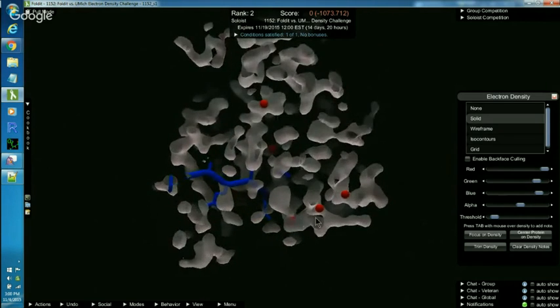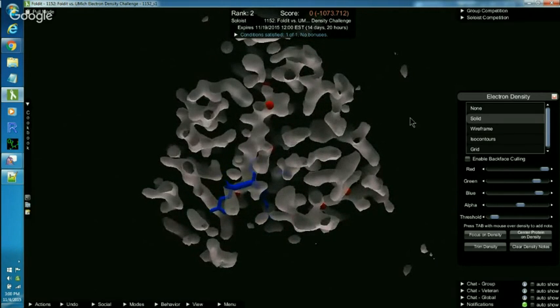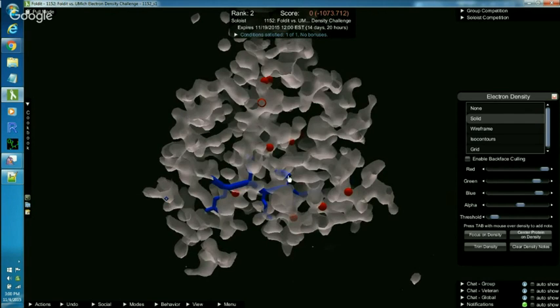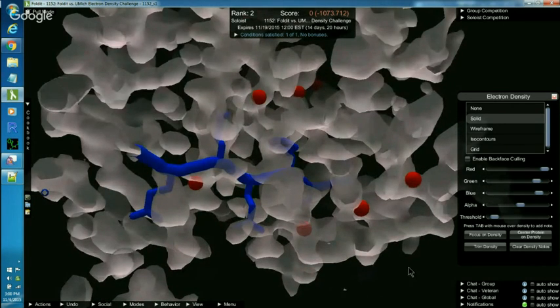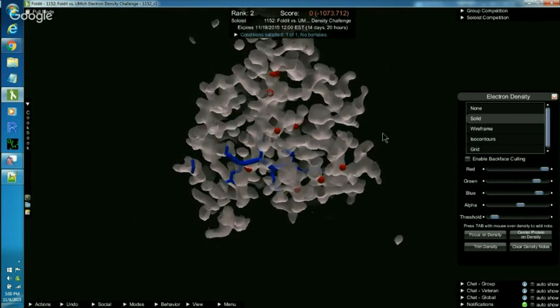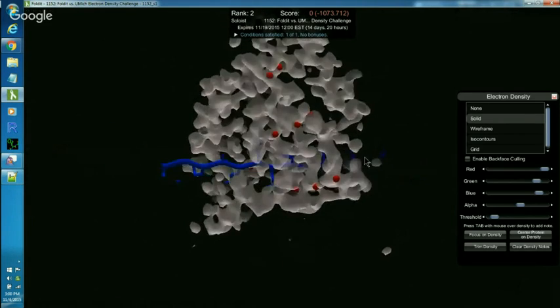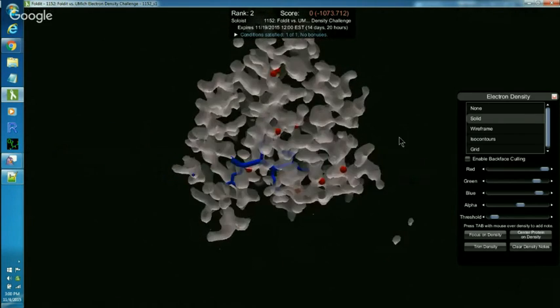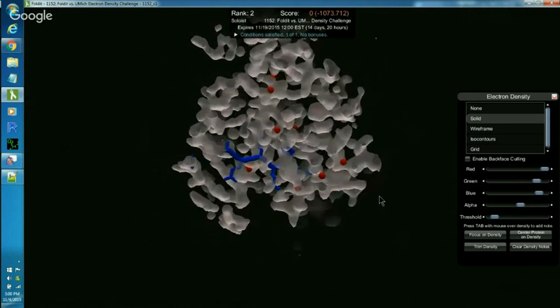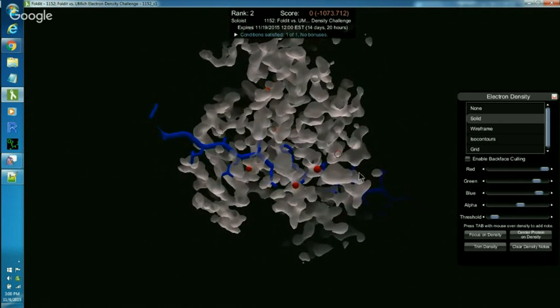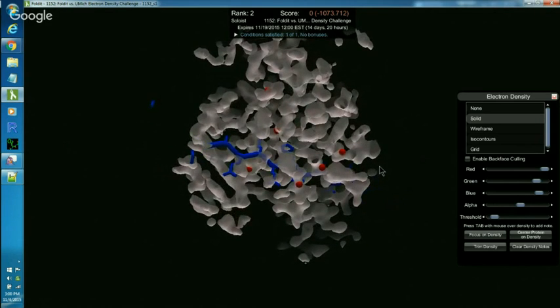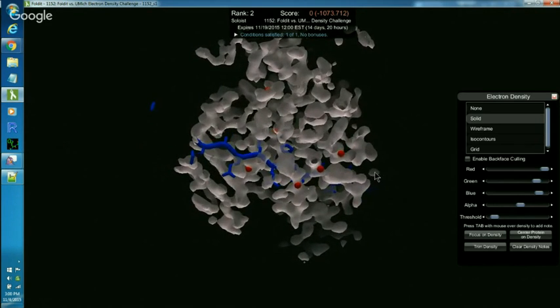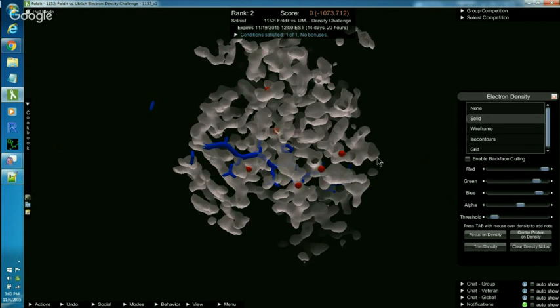So, I've found and marked four sheets in the cloud. Just so we can see them a bit better, I'm going to put my mouse on the backbone and hit shift Q again. That's going to give me my foreground and background back that I had cut out. That lets me see more at one time. And it turns out that this protein is predicted to have four sheets in it. So, just putting the four sheets that are predicted on the protein into the four sheets marked in the cloud is a good start for building a protein that will match the cloud.